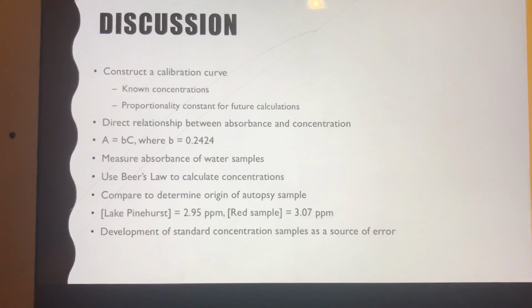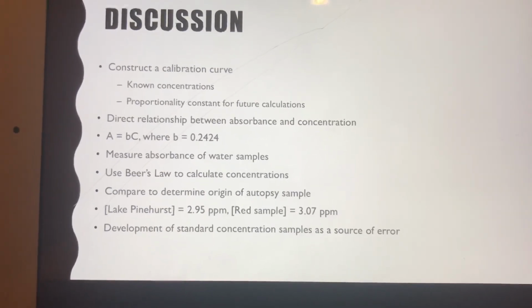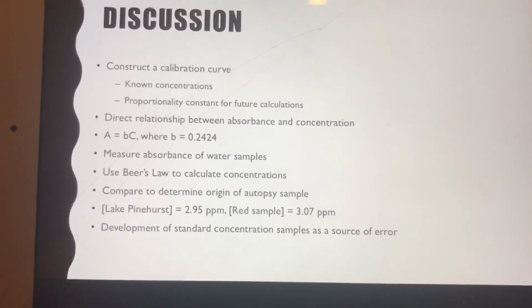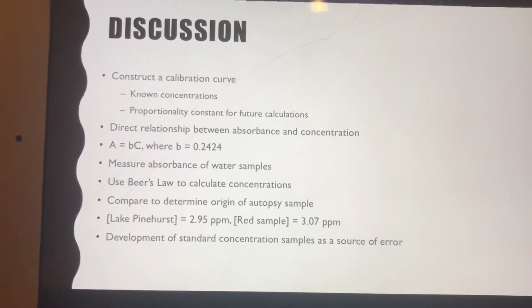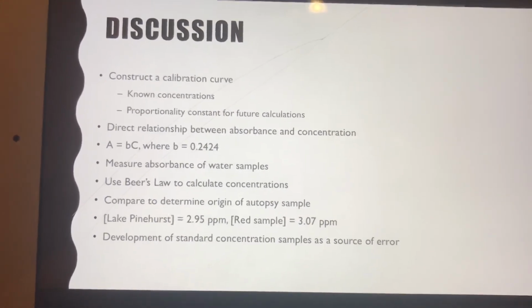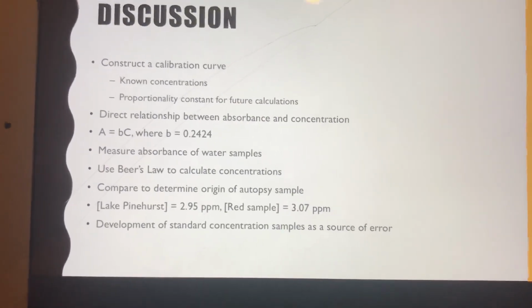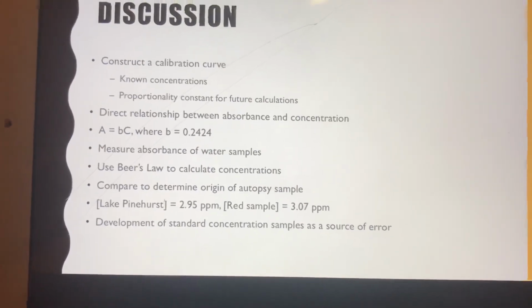Obviously it gets darker the more there is in there. But the directions say to let that reaction proceed for approximately 5 minutes before you put that cuvette in the spectrophotometer. If you shove that sample in the spec before it has time to fully develop, then you won't be able to see all of the phosphate that's actually present in that sample. So patience is key there.